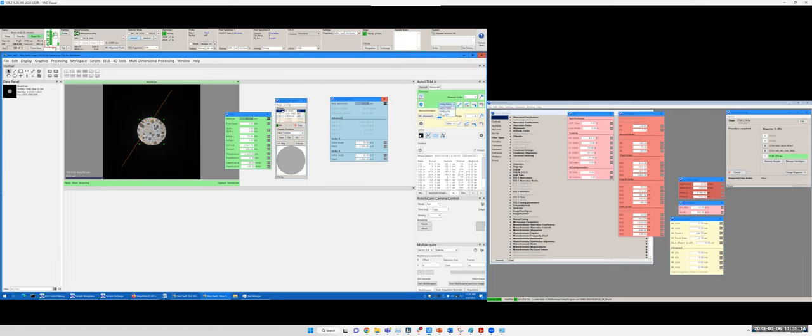On the left side is the lower order aberrations. On the right side is higher order aberrations. So you click this one, it fixes only the lower order aberrations. You click this one, you only fix the higher order aberrations. So they're separate. Normally in this mode setting, we don't take STEM atomic images, we only need to deal with the lower order. So I click lower order and Matter again.